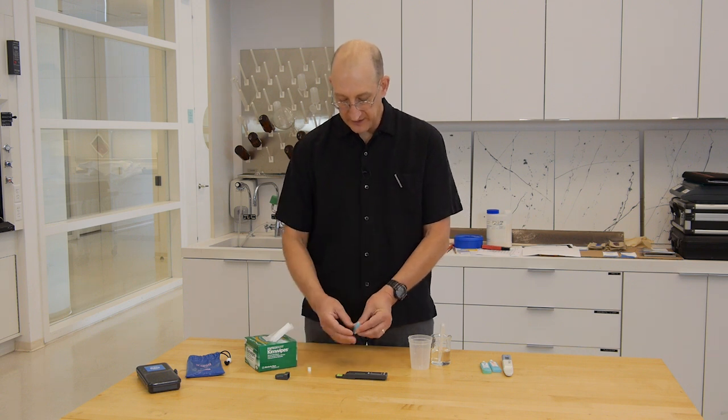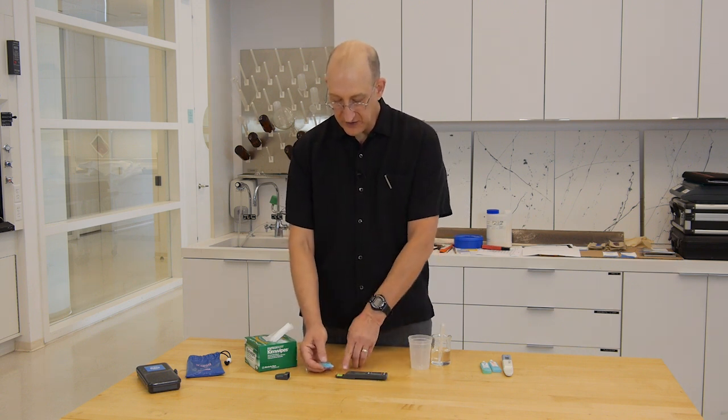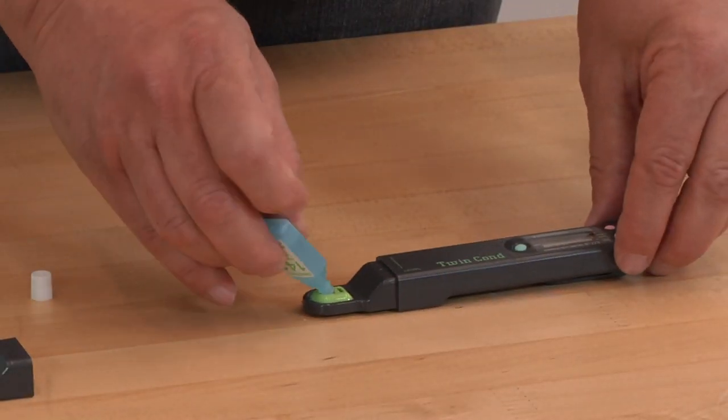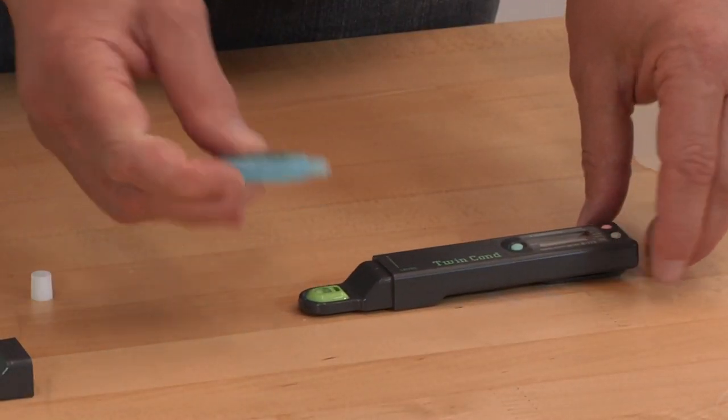The sample well is this little green thing. The measuring electrodes are here in the black section, and we just want to fill the reservoir with calibration solution.